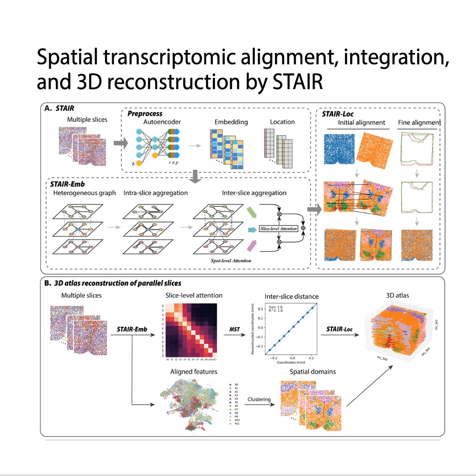And to see this scaled up, they successfully applied STAIR to reconstruct a whole mouse brain atlas. 40 coronal half-brain slices along the entire anterior-posterior axis. And the 3D reconstruction was highly accurate. They validated the whole thing by checking for biological plausibility. They looked for region-specific marker genes. For example, they confirmed that genes like DSP mapped correctly to the hippocampus, GPR88 mapped to the striatum. All exactly where the anatomical map would predict in the new 3D volume.